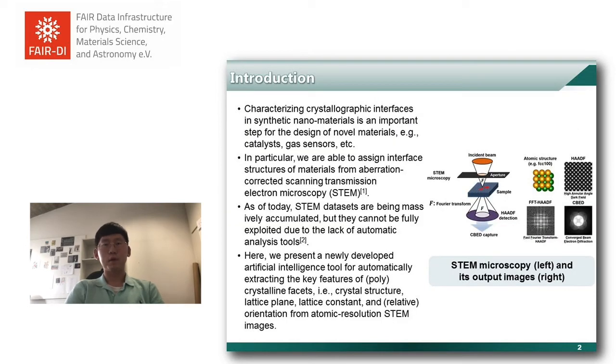To begin with, I'm going to tell you the introduction part. For designing novel materials, it is very important to characterize crystallographic interfaces in synthetic materials. In particular, from the output images of STEM, which stands for Scanning Transmission Electron Microscopy, we can assign interface structures.